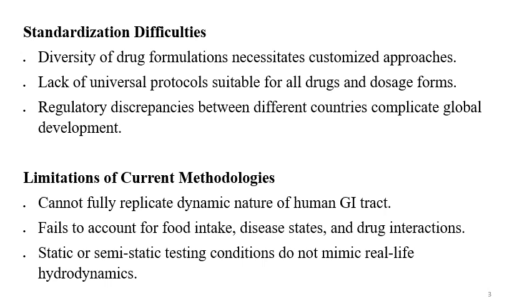For example, if you are mimicking the GI environment of the stomach, you get some results. You are also doing another dissolution test by mimicking the GI environment of the intestine. But when the formulation is actually administered, it goes into the stomach environment followed by the intestinal environment.